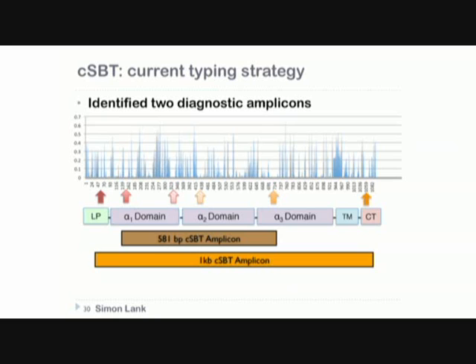Right, so the question is, since the 454 reads are only 400 base pairs long, how do you sequence a 1 kb amplicon? The answer is we don't sequence the entire thing. What we do is we sequence off both ends, and then we read into the 581 base pair amplicon, and we assemble using the overlap regions, because again, we already know which lineages we're trying to discriminate between because of the data we have from the 580 base pair amplicon.